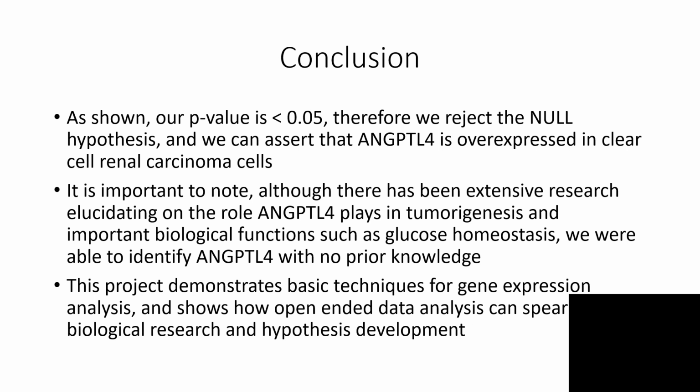In a more typical analysis, we wouldn't just focus on one gene. We would want to analyze all of the genes that appear in our cluster maps or in our dendrograms. Ideally, we would want to find a gene that has not been extensively studied, or at the very minimum, a gene that has not been studied in the context of what we're actually looking at. In this case, it's kidney cancer.